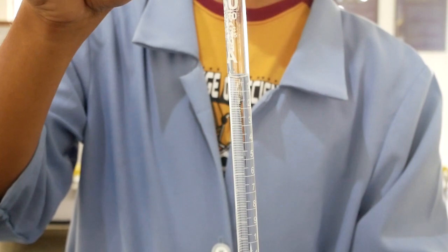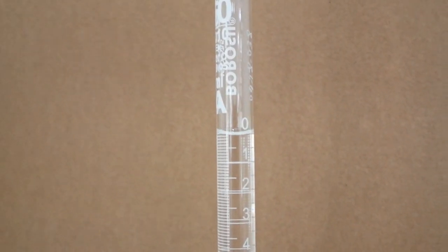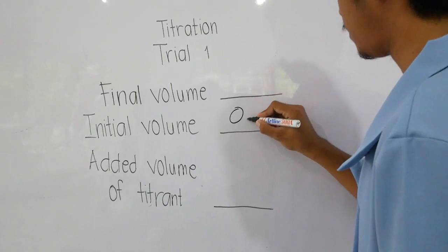Then, fill up the burette to capacity, which should be about zero milliliter. Record this as your initial volume.